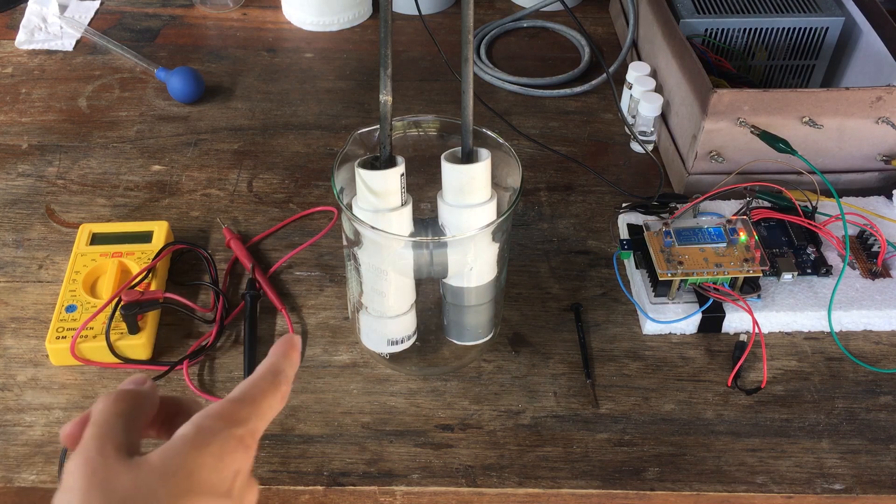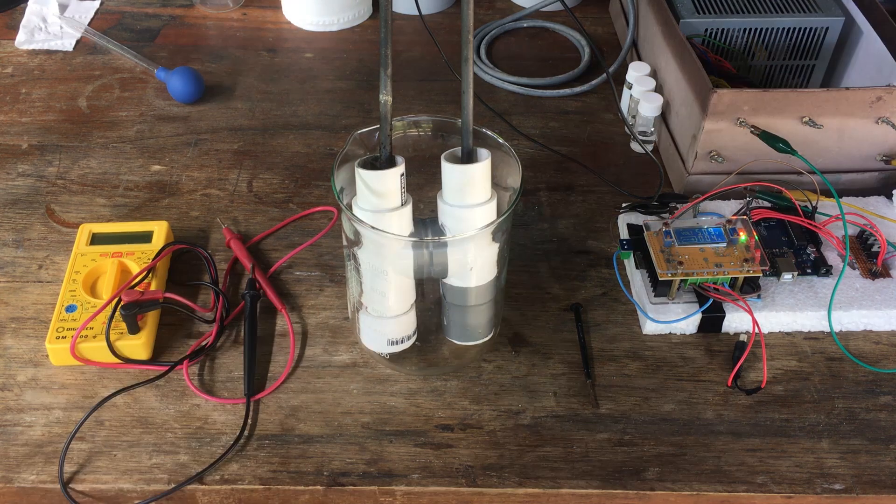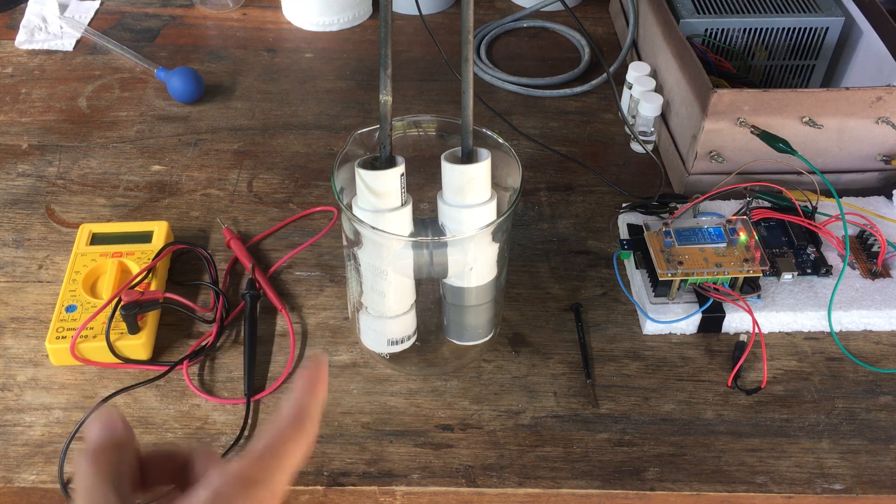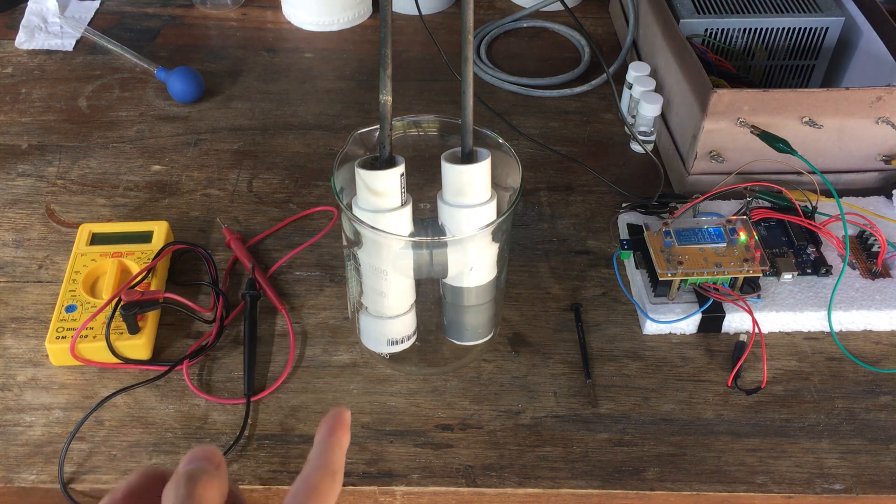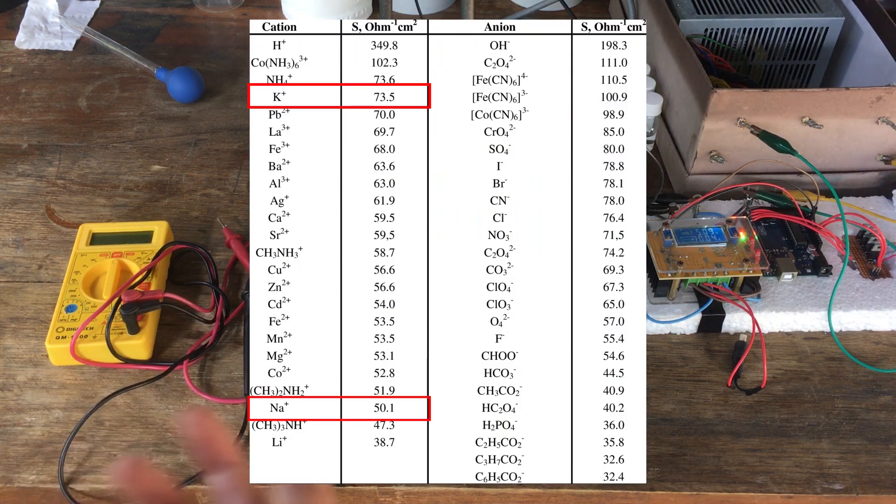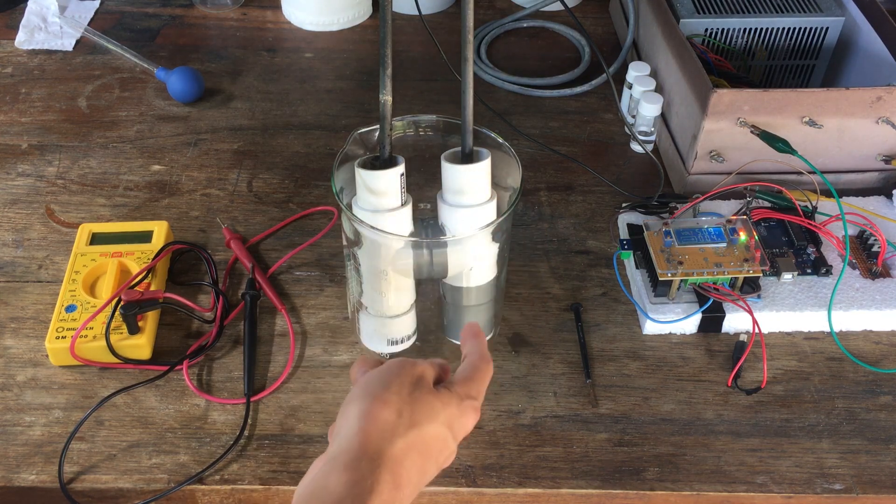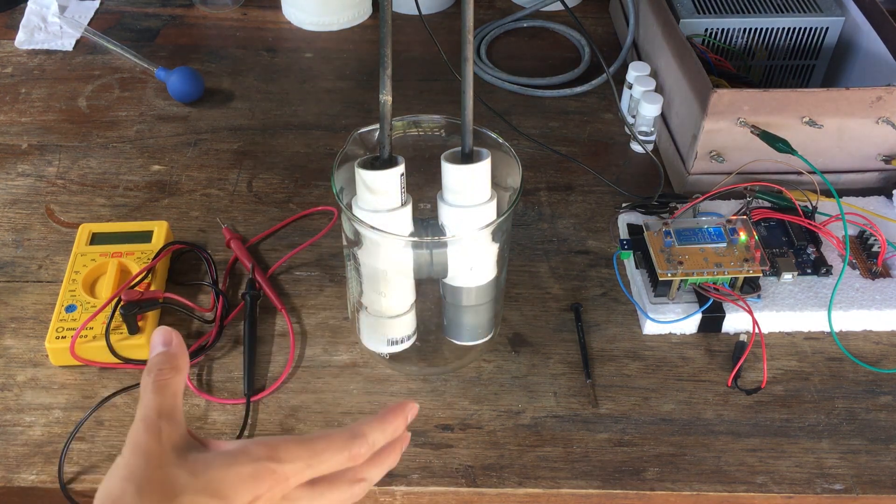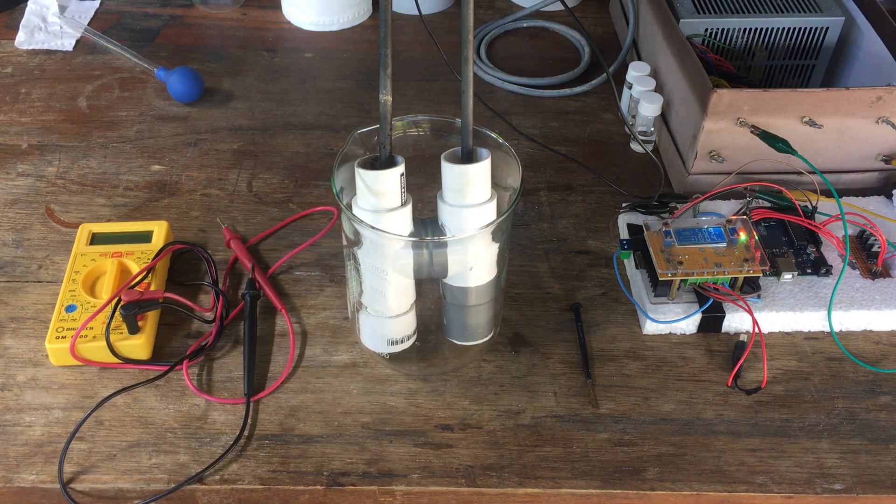Anyway, the reason that I'm going to the effort of comparing the efficiencies regarding the sodium ion and potassium ion processes separately is because the potassium ion process should be slightly more efficient than the sodium ion counterpart. My reasoning behind the potassium ion process being slightly more efficient comes from the fact that in aqueous solution, potassium ions are slightly more mobile than sodium ions by a factor of about 50%.